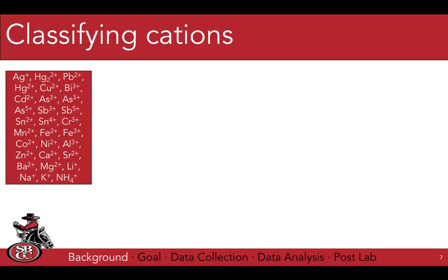Did it dissolve? Didn't it dissolve? Did it make a precipitate? Didn't it? We don't want spectral results. So before we go on, I have to ask, and I'll wait for a response. Does anybody know what a group 1 cation is? I've asked a few students already, so if I've already asked you this, I'm not talking to you, but anyone I haven't asked this question to, we're talking about group 1 cations. Anyone know what that is?